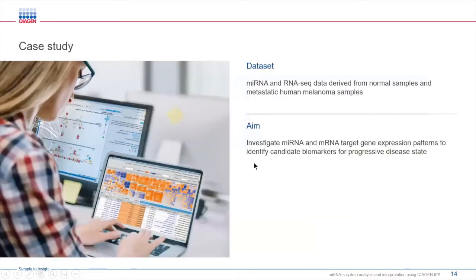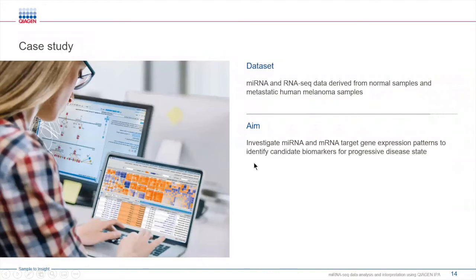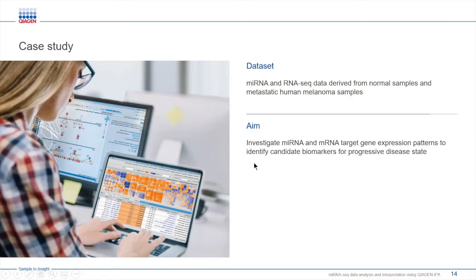Today we're going to imagine a scenario where you are studying melanoma, a cancer that arises from the pigmented cells in the epidermis. As part of your research, you obtain microRNA and mRNA expression profiles derived from normal samples and from samples from patients with metastatic melanoma. You want to identify mRNA candidate markers for this progressive disease state. The first question you may ask is, what mRNAs do my microRNAs from my dataset target? We're going to use the microRNA target filter to answer this question.